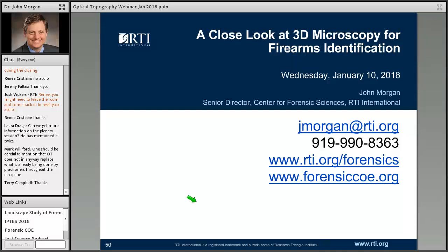We definitely do. The first one is more of a comment that came in from Todd Weller. He just wanted to make mention that the Cadre forensic system is commercially available now and has actually been validated by the FBI for use in virtual microscopy. Oh, fantastic. Thank you, Todd. I did not know that. That's new information.